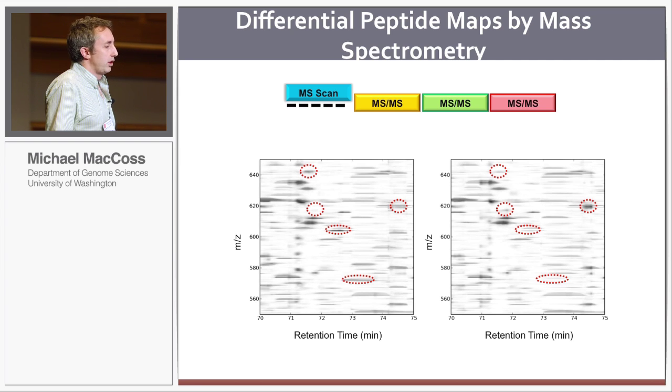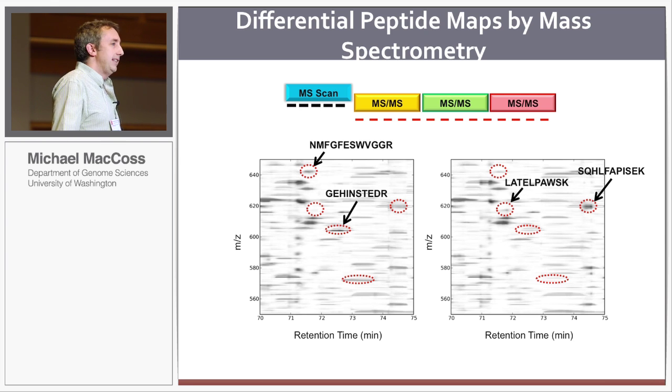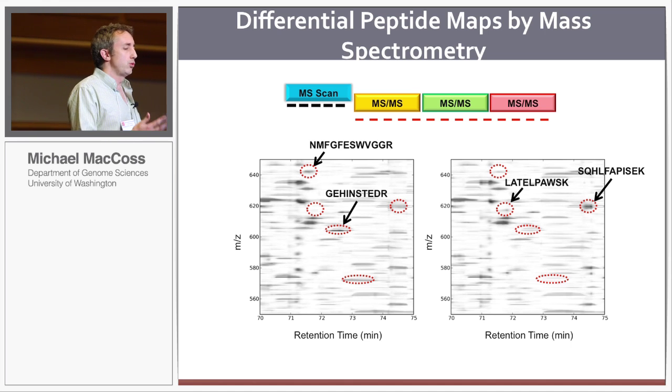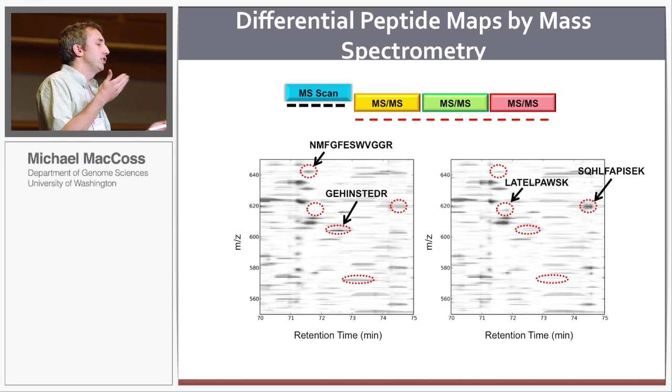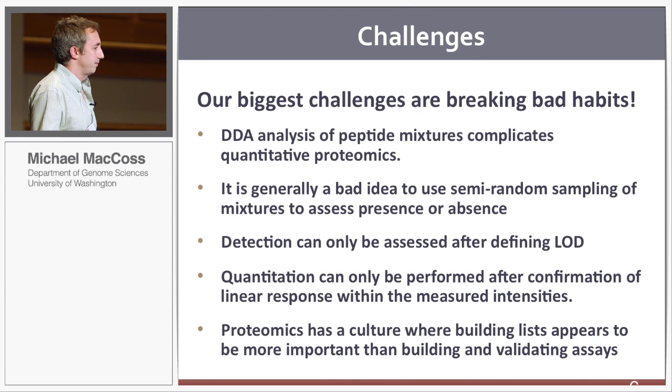We've done a lot of label-free quant and a lot of stable isotope labeled experiments, but this is just an example where we want to focus on these peaks because this one has gone down from here to here, this one has gone up from here to here, and this one has just gone down, et cetera. Then we can use our MS spectra to try to annotate these differences. Using accurate mass and high-resolution data in MS1 mode has been a really powerful approach for us. In many ways, you're taking a targeted approach, but you first look at what's different, and then decide where your effort is going to be in focusing your identifications.